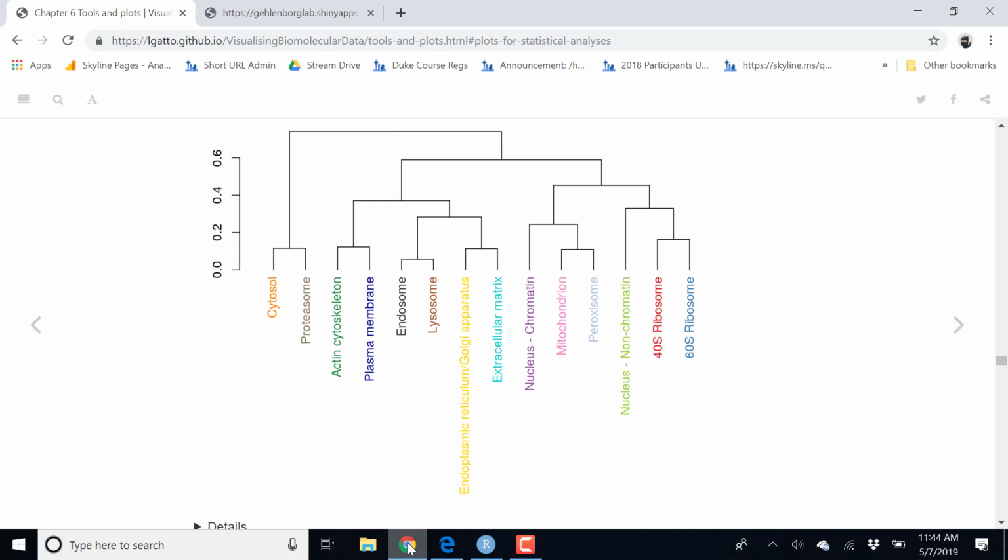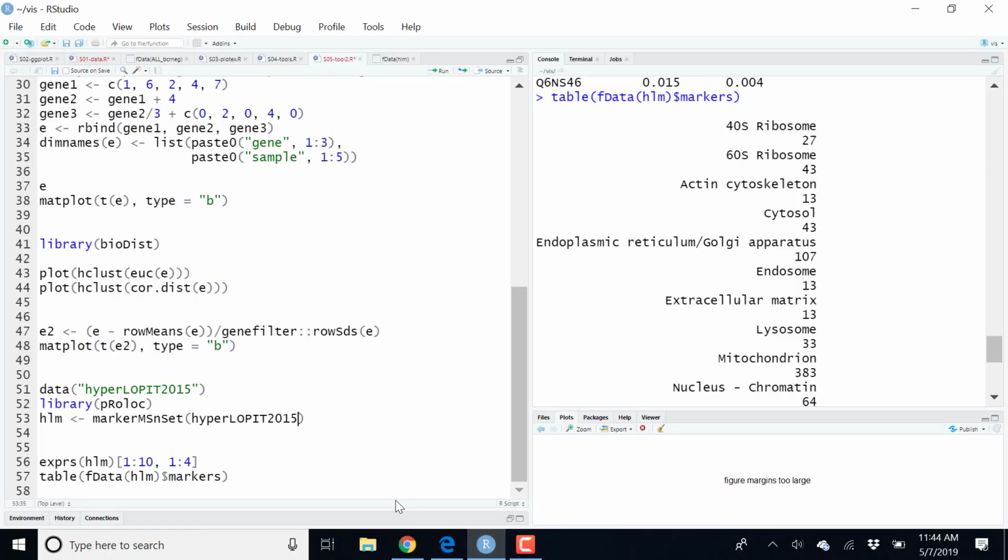So there is no coherent signal in all those that are called unknown. Calculating an average of all these profiles would not make sense. So it's better to remove them and then do our analysis on a positive control. But the function automatically chooses the column. So the function has a variable called fcol for feature column, and by default that one is markers.